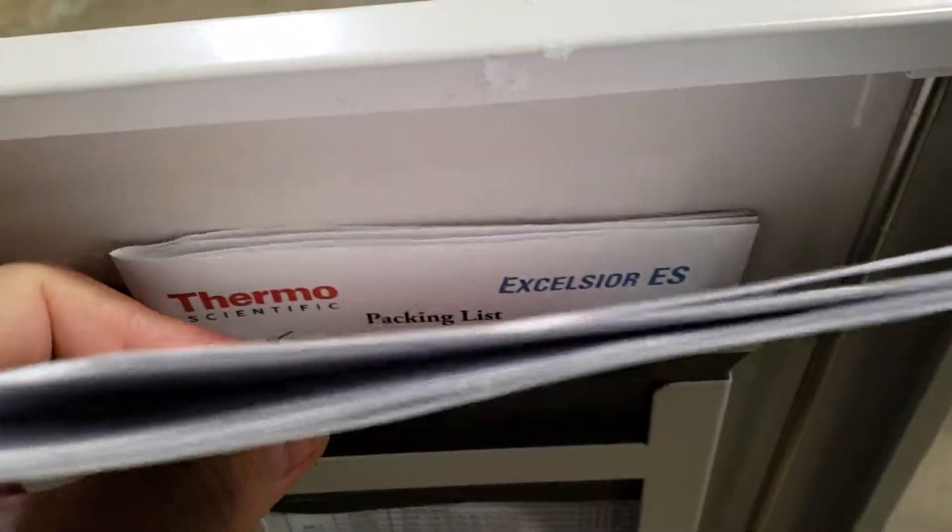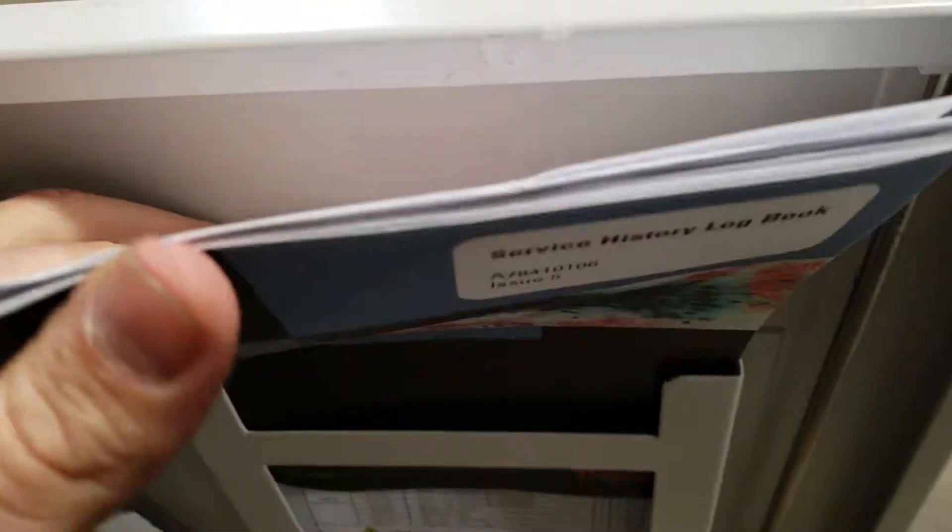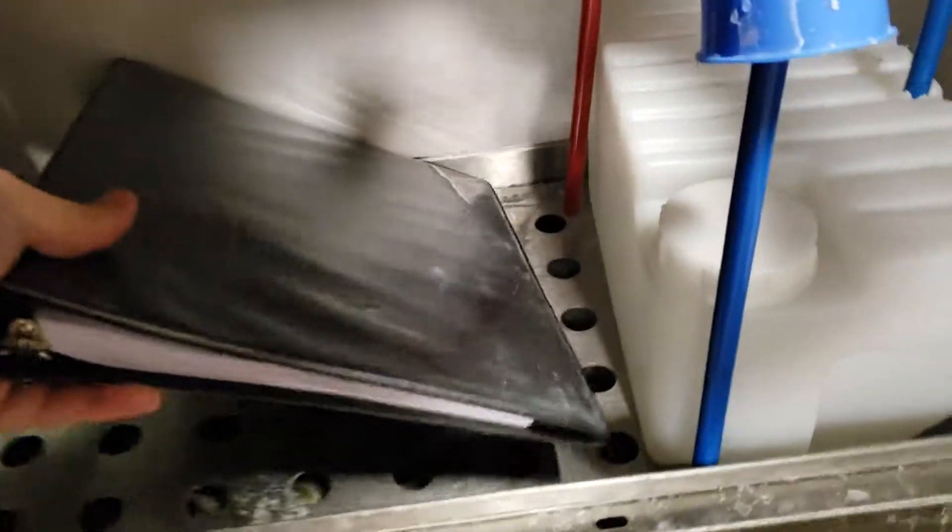I have a packing list down here and this manual. There are a couple of standoffs here too.